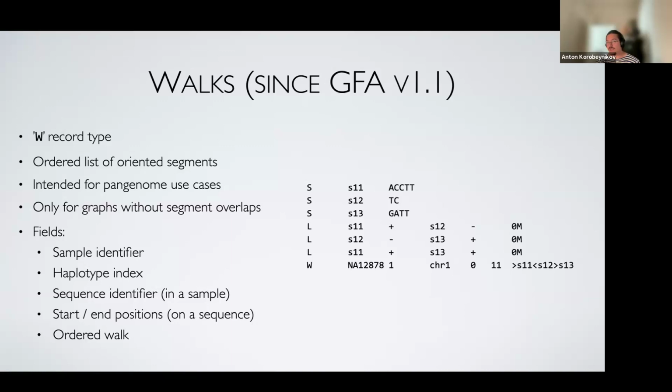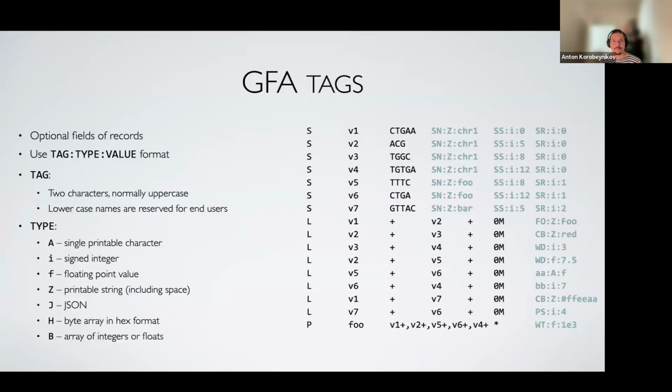So yeah, the format is pretty straightforward. It can even be modified by hand, and you could use all those text processing utilities to operate on the assembly graph, like drop a path or find a link or whatever, and even extract a subgraph if necessary.